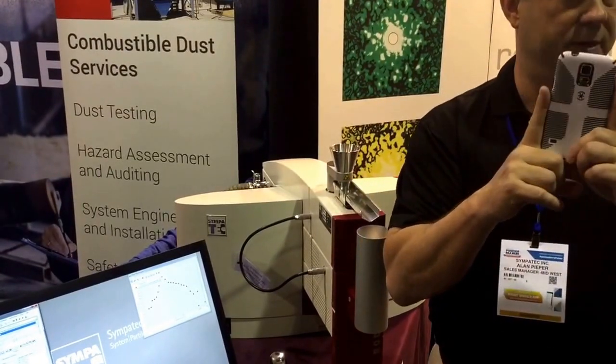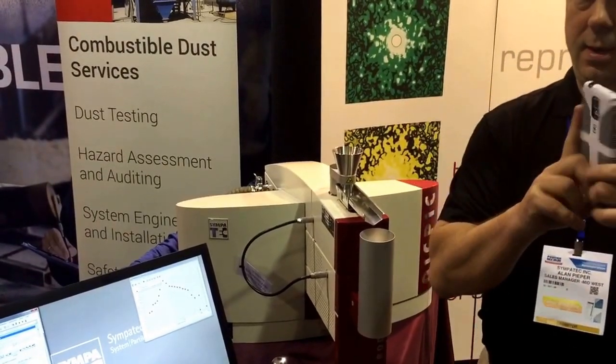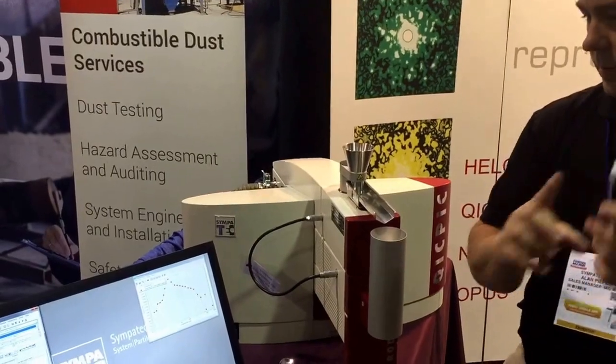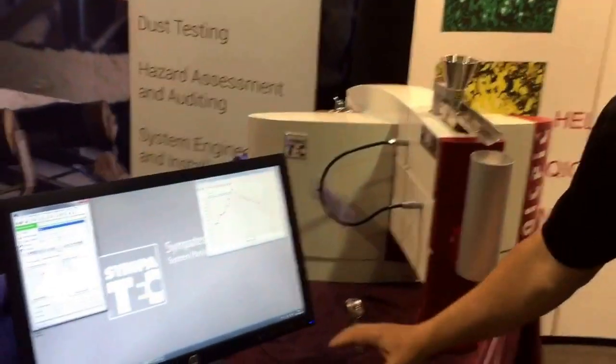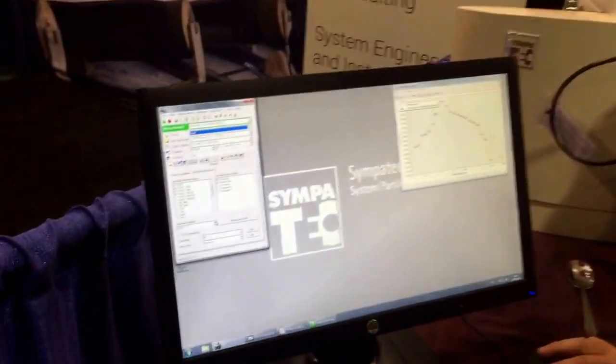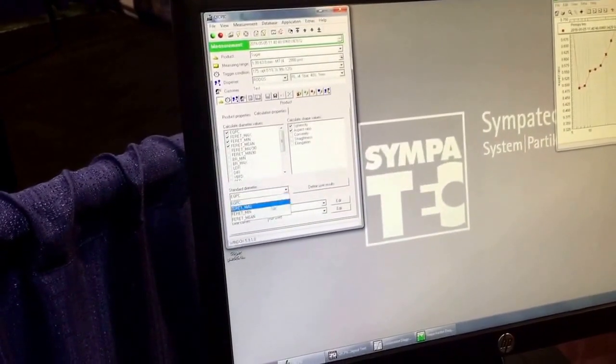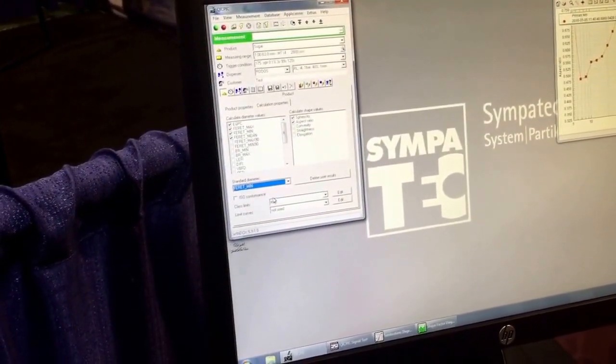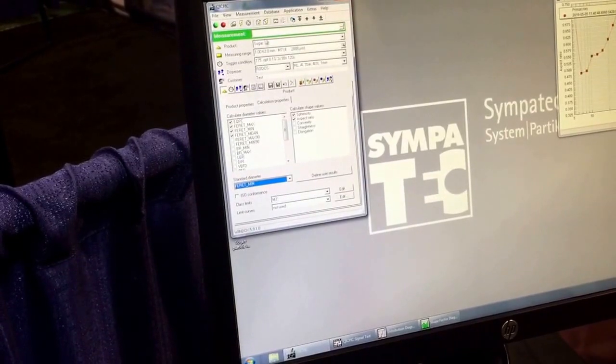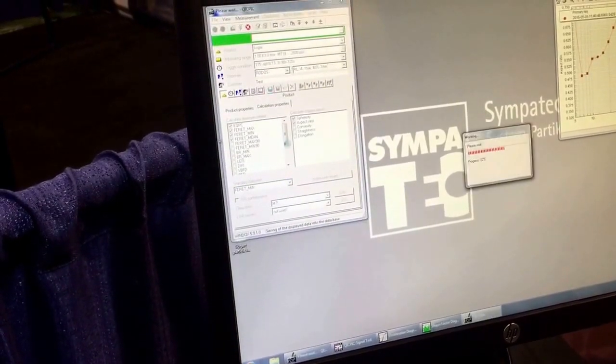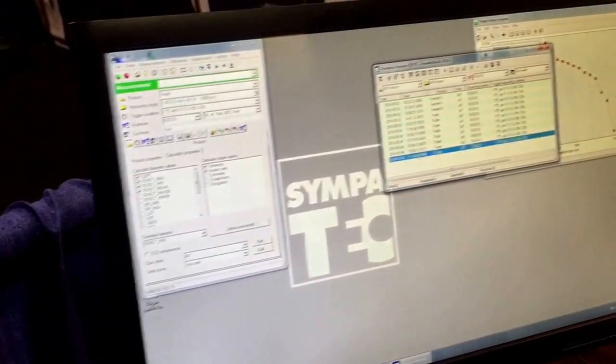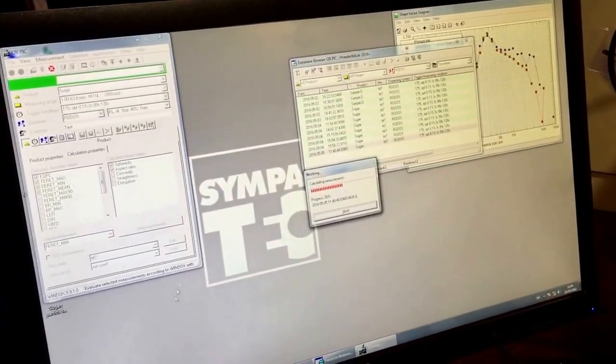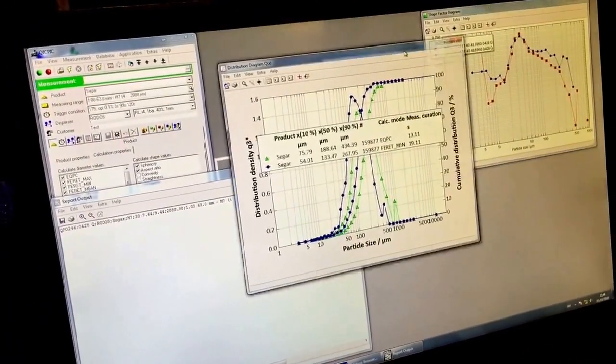So it knows where the maximum diameters are, where the minimum diameters are. I can go back now and say, okay, show me, overlay the minimum diameter distribution on what we just did. I want to see what that spread looks like. So I save it and then I can go back here to the database, reprocess it.